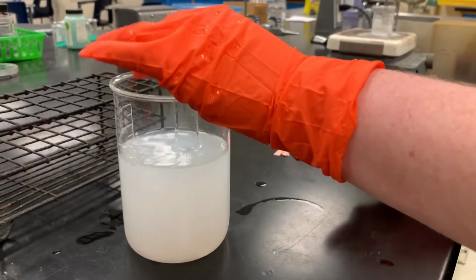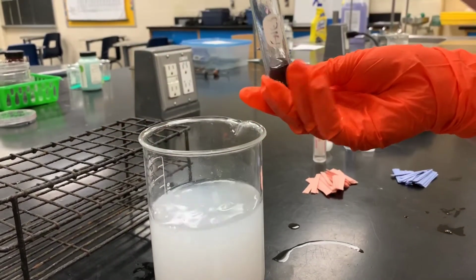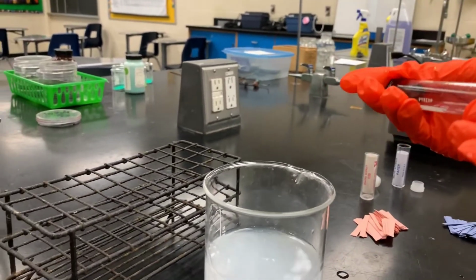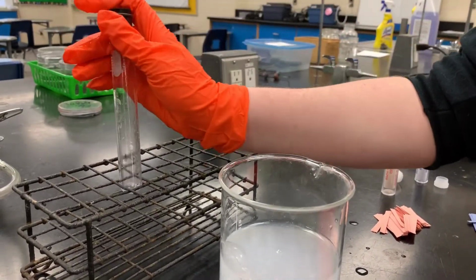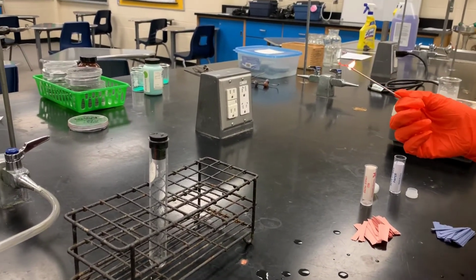Now that we have the test tube completely filled with gas, we're going to pull that out, stopper that, and put it into our test tube rack. So now we have a burning splint. We're going to test the gas.